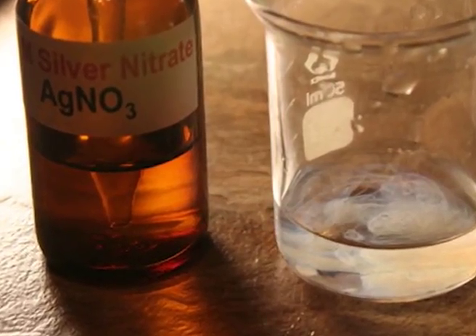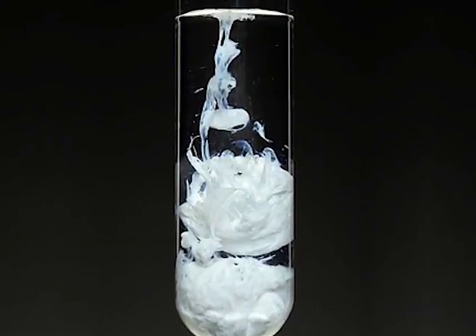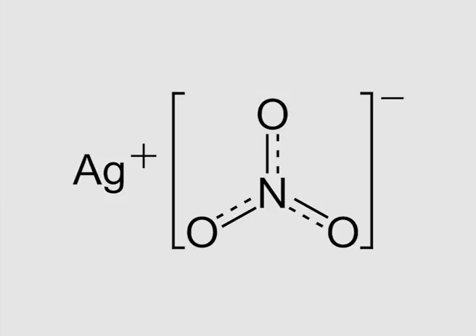Detection of the latent fingerprints by silver nitrate is based on the premise that the said reagent undergoes chemical interaction with the chloride content of sweat residue. This reaction produces a precipitate of light sensitive silver chloride. When white colored insoluble silver chloride is exposed to either sunlight or UV radiation, it gets reduced to metallic silver. The reaction scheme has been depicted on your screen. The finely divided black or brown colored metallic silver adheres to the ridges and visualizes the print.